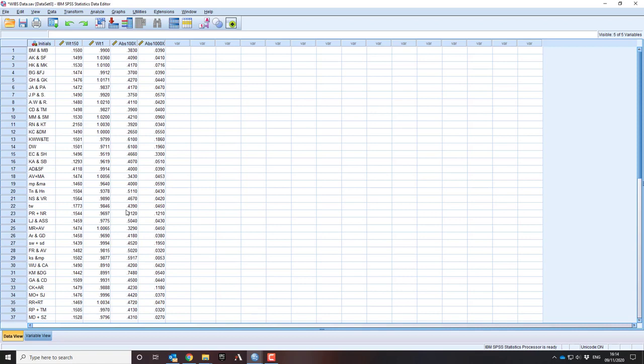This would suggest that when the calibrations were done, or if the pipettes were all bought from the same company, that company slightly underestimates its values in terms of volumes. So all of the pipettes from that particular company, or all of the pipettes serviced from a particular company, are calibrated in the same way.